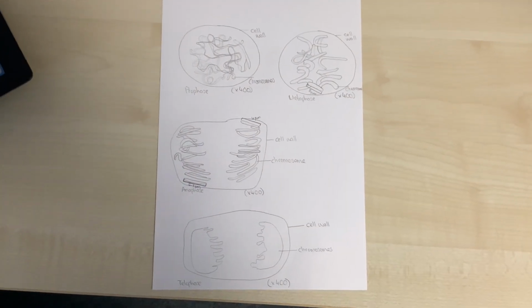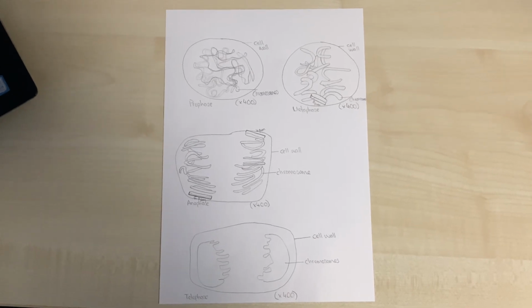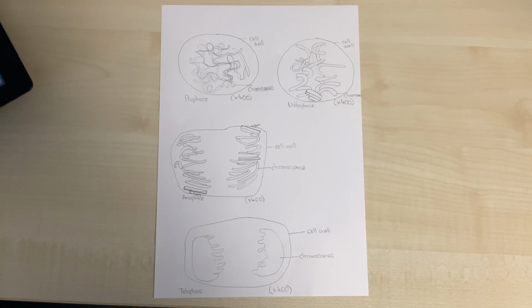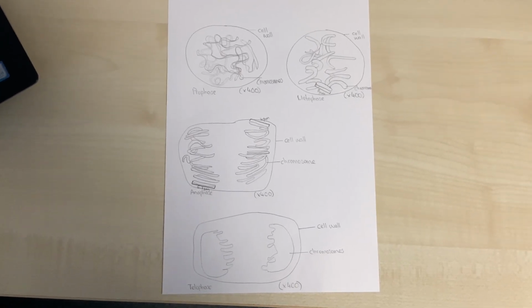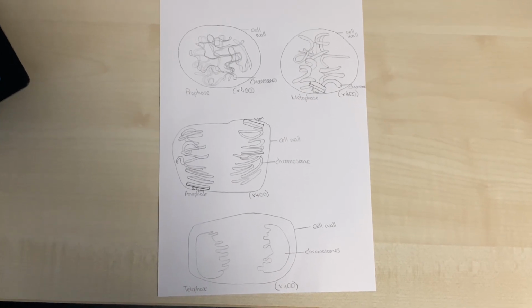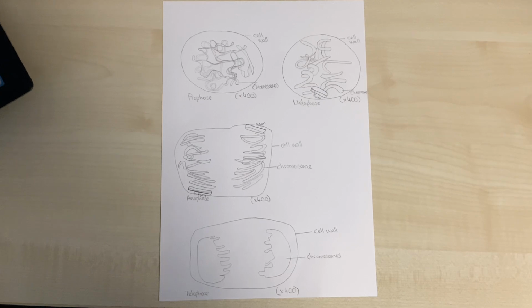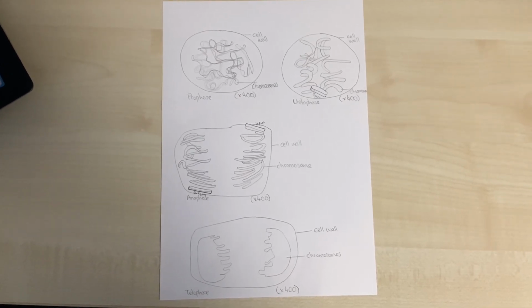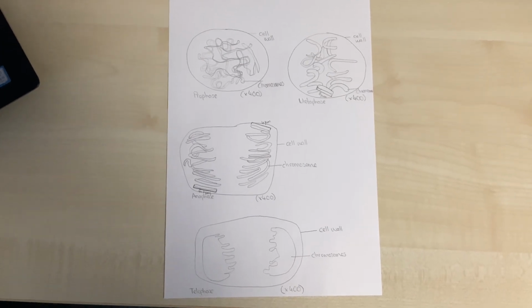Take time to look carefully and identify each stage of mitosis that can be seen at different magnifications. As you can see from these diagrams, I had the best magnification to see all the components of the cells that were visible at ×400. I've then labelled each of the diagrams using straight horizontal lines with no arrowheads, labelling only what it is that I could see through the microscope. If you can see more structures than the cell wall and the chromosomes, then you must label these on.